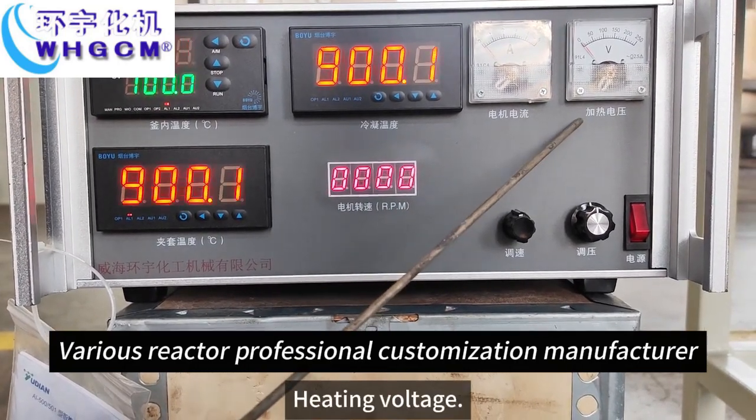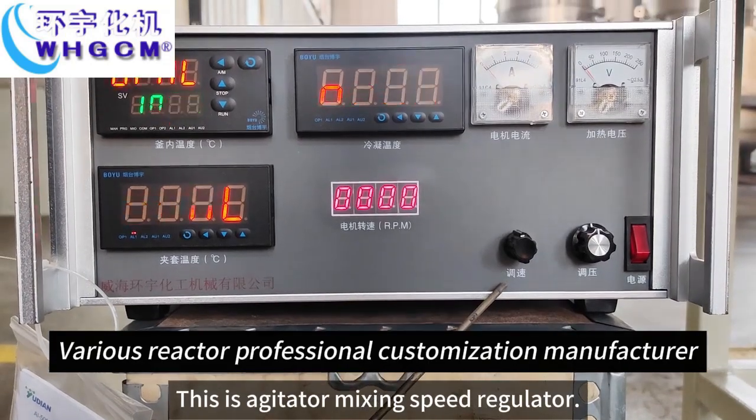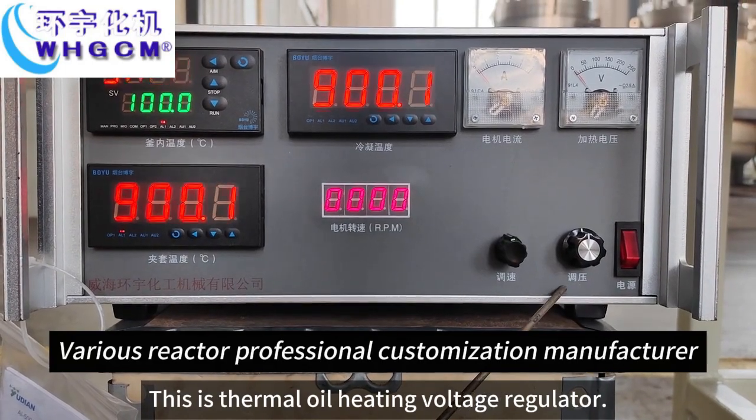Motor current, heating voltage. This is the agitator mixing speed regulator. This is the thermal oil heating voltage regulator.